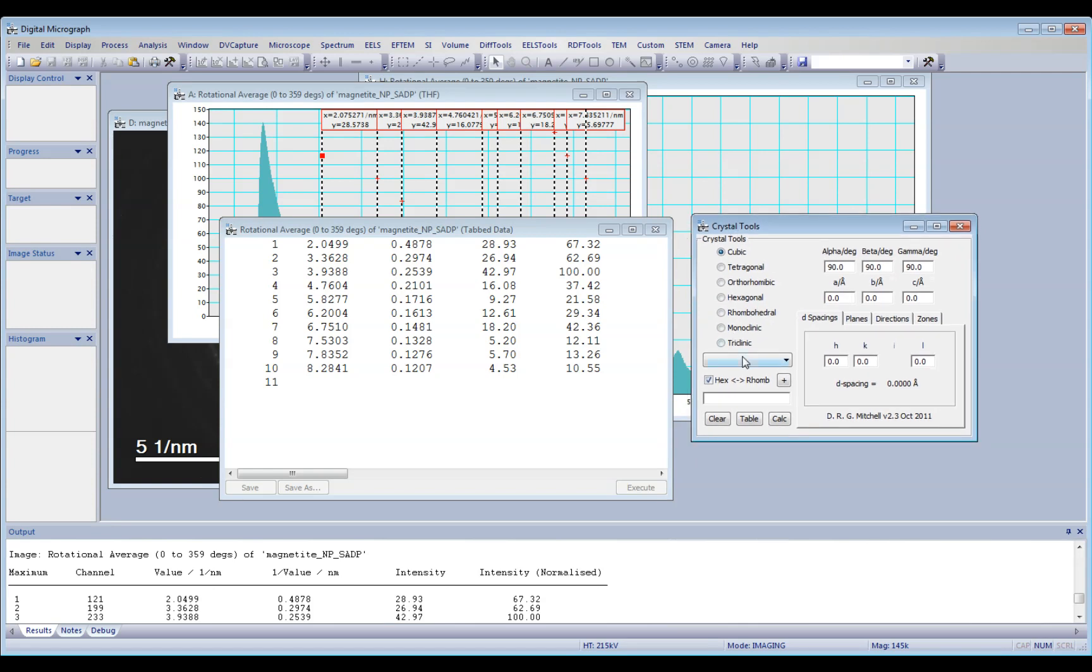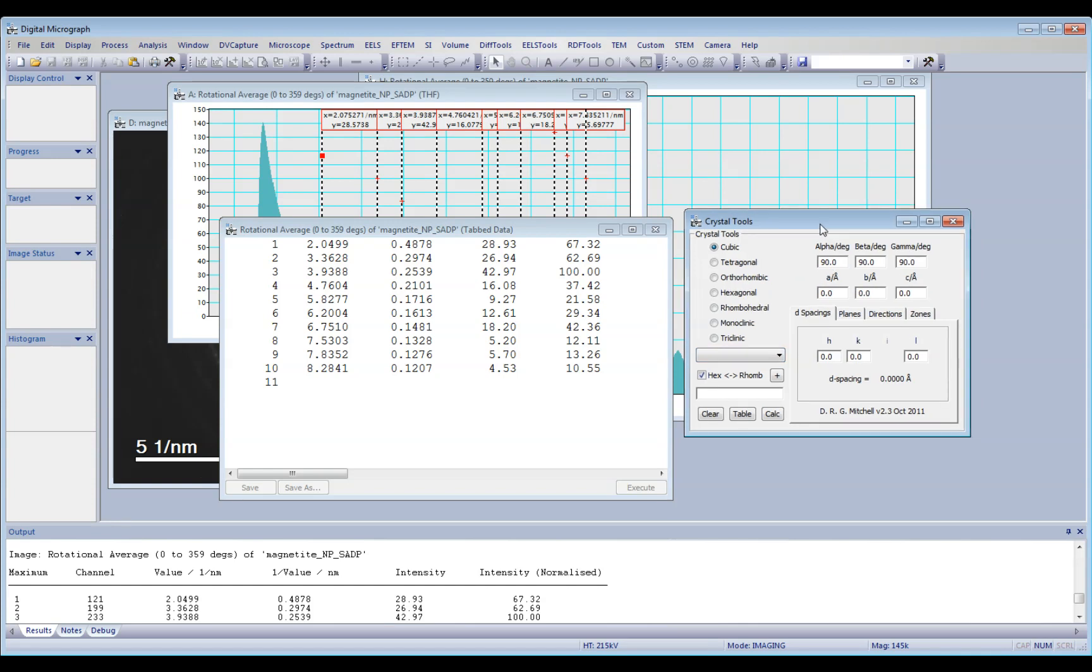So on the crystal tools, you have to enter these values here, actually the lattice parameters of the material you are interested in.